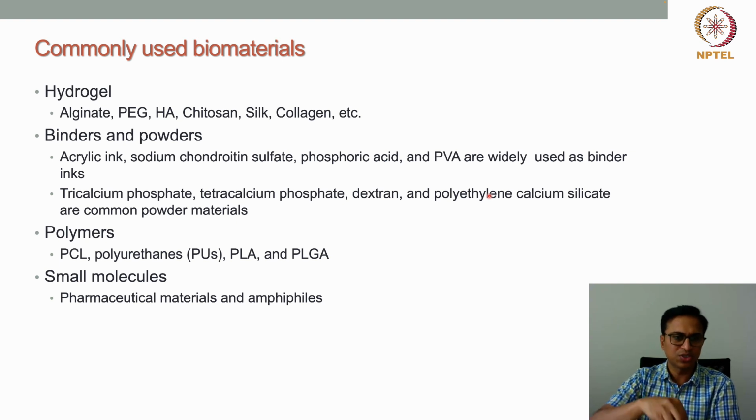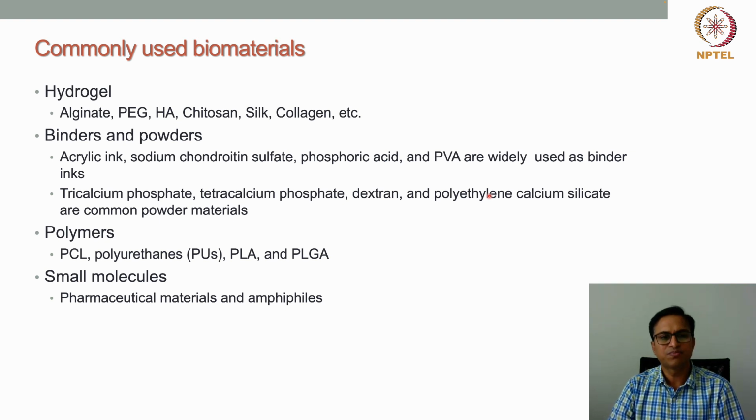If we put them at certain locations of this powder bed, these binders will bind the powder material at those specified or pre-designed locations or coordinates. In this way also we can prepare 3D structures, right?